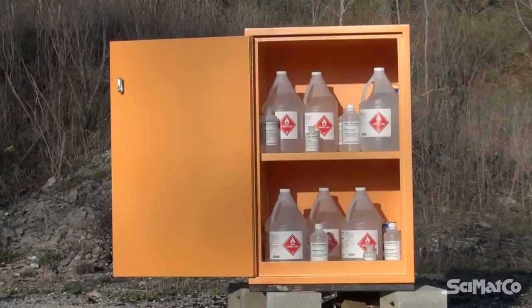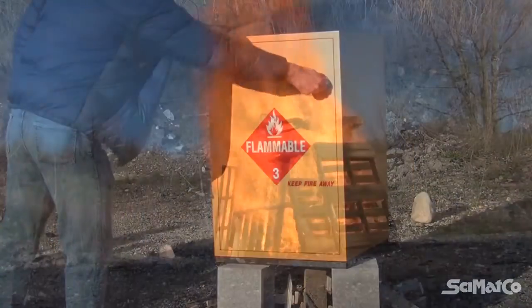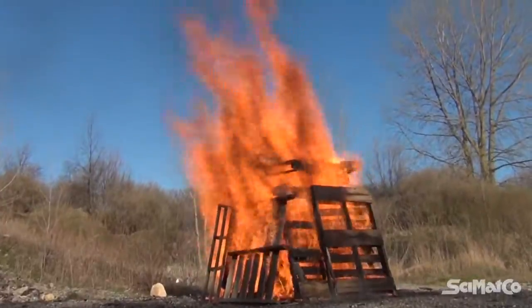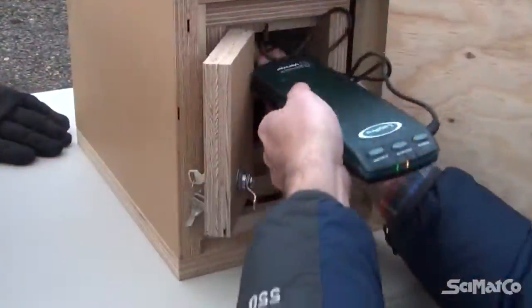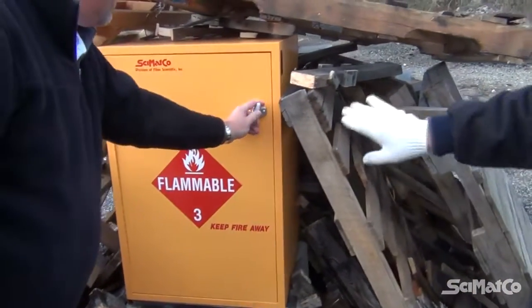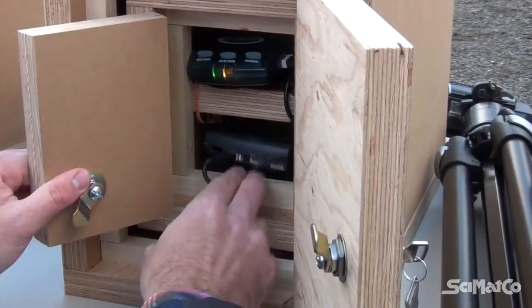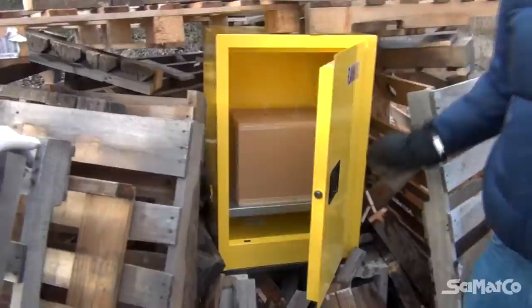We filled a one-inch thick plywood constructed Cymaco cabinet with flammable chemical bottles and fully engulfed the cabinet in flames for 12 minutes. In another test, we placed a temperature sensor box inside a wooden Cymaco flammable chemical storage cabinet and an identical temperature sensor box inside a metal flammable chemical storage cabinet.